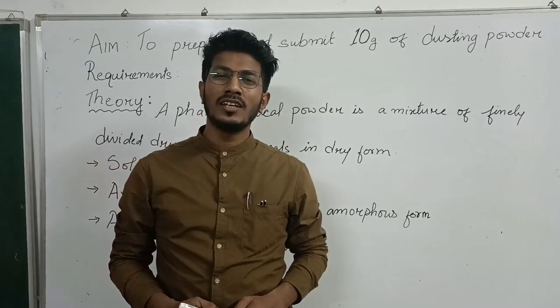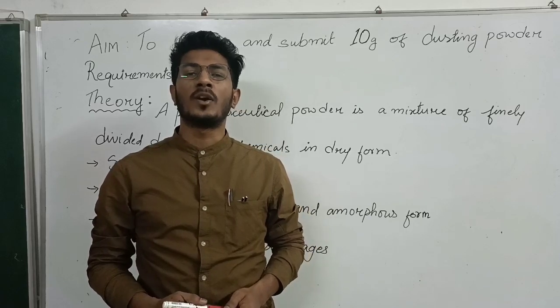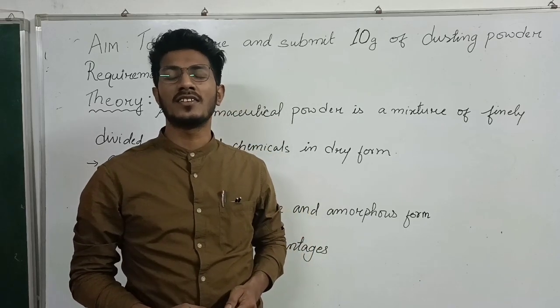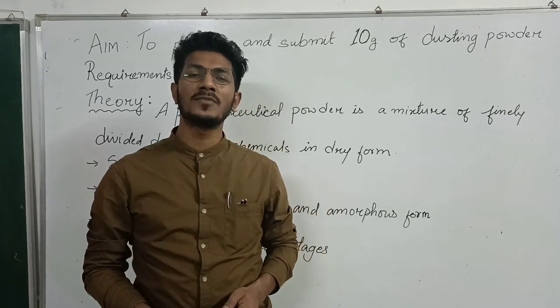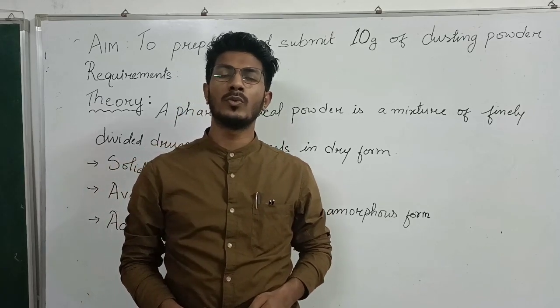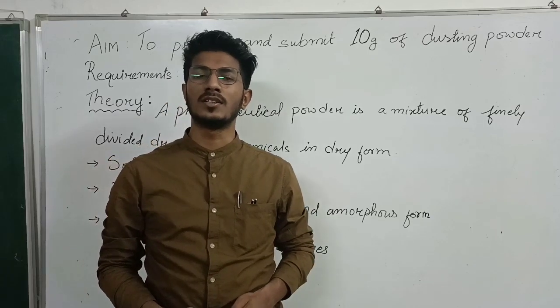Hello and welcome everyone. In this video lecture, we are going to learn about an experiment related to pharmaceutics, that is to prepare and submit dusting powder. So we will be preparing and learning how to prepare a dusting powder in the laboratory. Along with that, we will learn what necessary information we need to know about dusting powder.